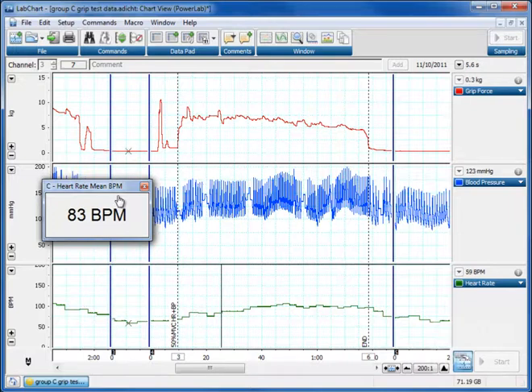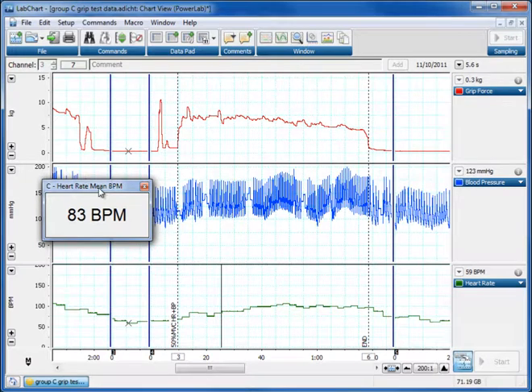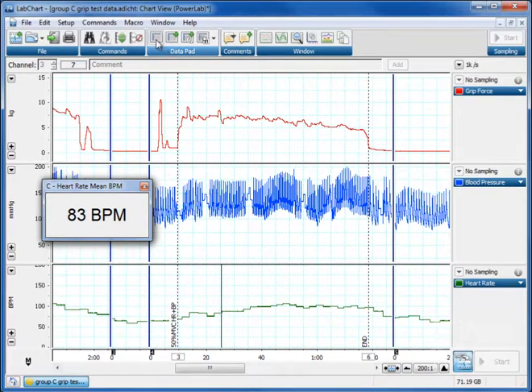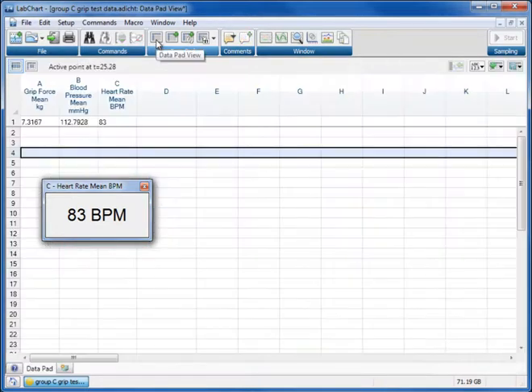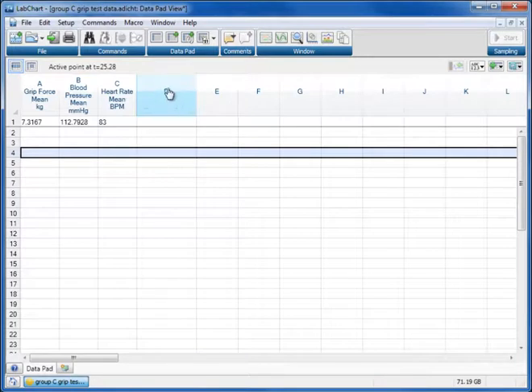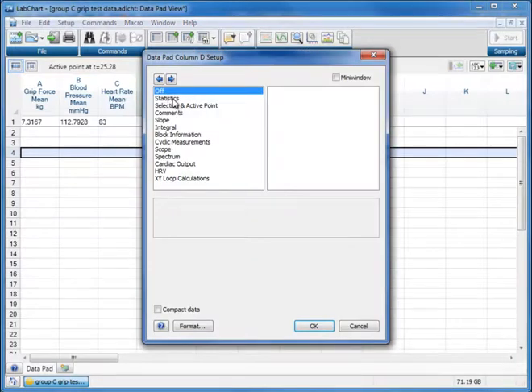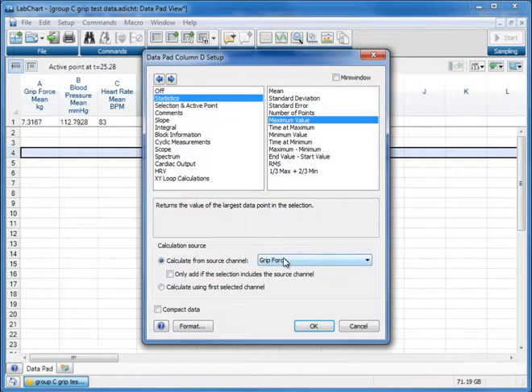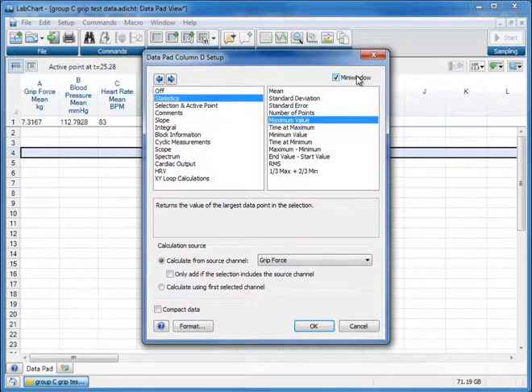Equally you can use one of these little mini windows to tell us what the maximum or the minimum data is. So let's say you want to know what the maximum contraction was over this period here. We go back to our data pad. We can add a new channel. Let's close him for a second. Add a new channel on D. Go to statistics and choose maximum value and we'll select grip force. Put a mini window up.